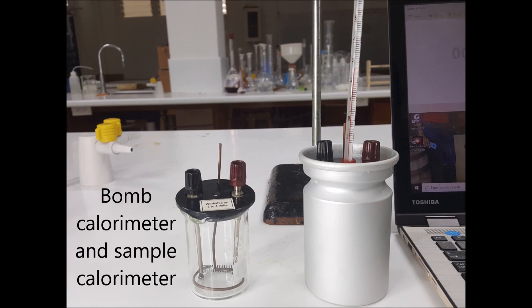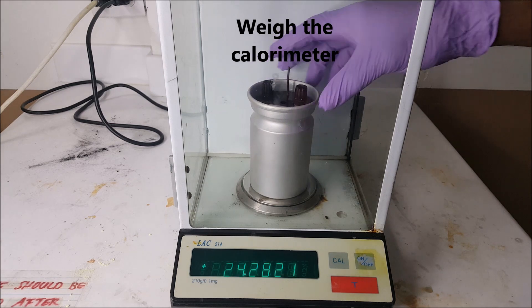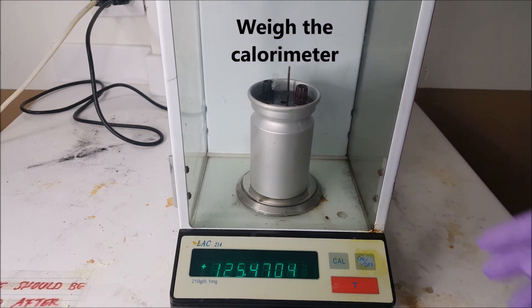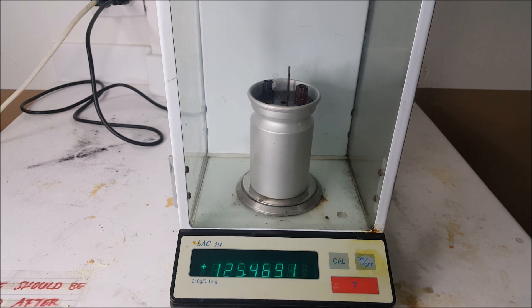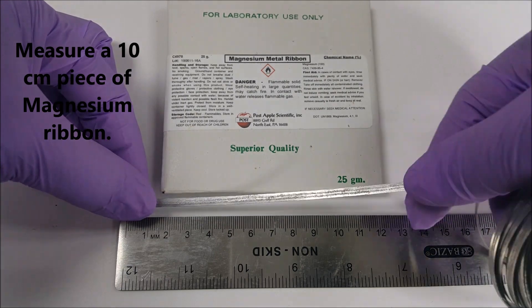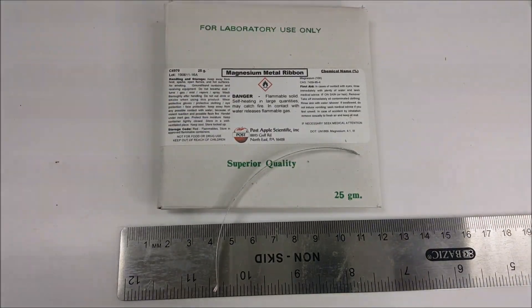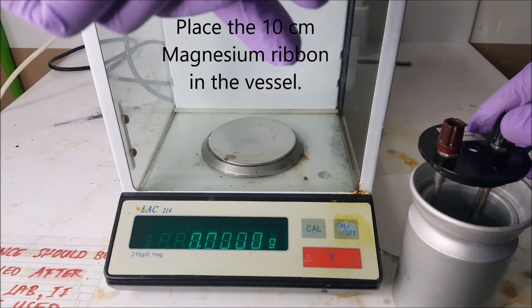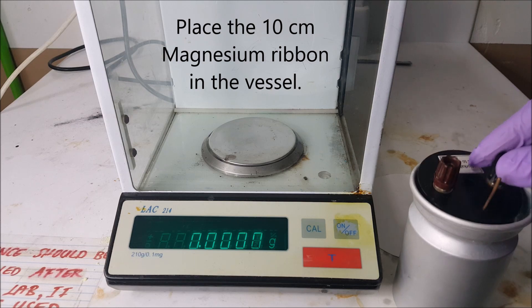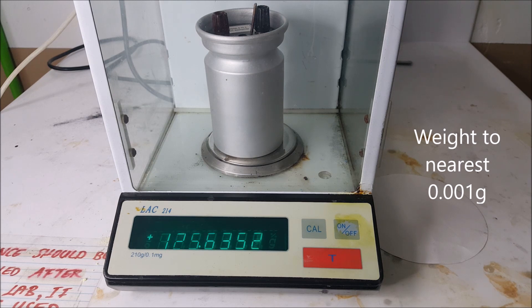We will demonstrate using a sample calorimeter. We start by finding the weight of the calorimeter by itself to the nearest 0.001 decimal places. We then measure 10 cm of a magnesium ribbon strip, which is placed in the calorimeter and weighed again. To find the weight of the magnesium ribbon, subtract this weight from the previous weight of the calorimeter.